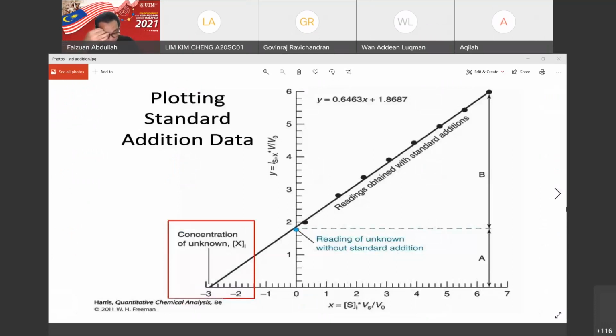Now for C, okay, in the lab manual, in part C, procedure C, is determination of zinc using the standard addition method. Right? Instead of preparing the series of calibration solutions with increasing concentration using distilled water or ultra pure water or deionized water as the blank, to prepare the calibration solution, right now we have to add some concentration of our sample. Remember?